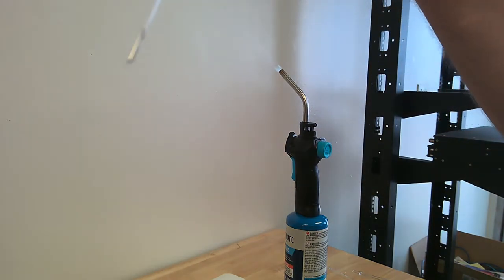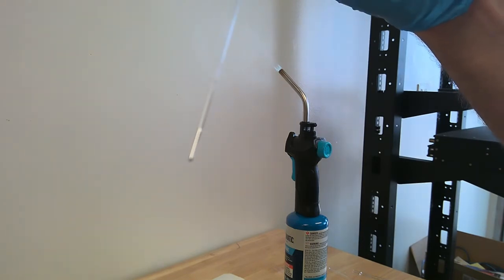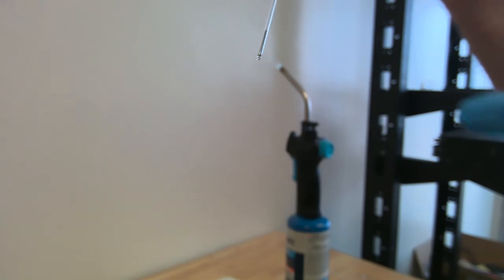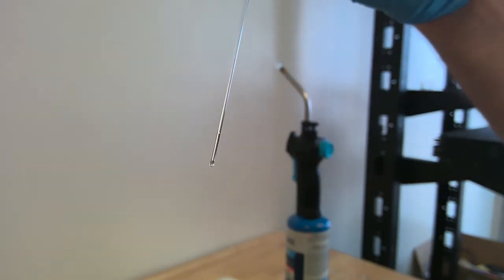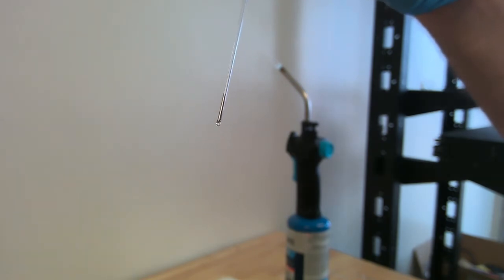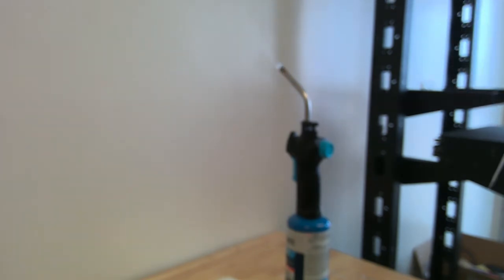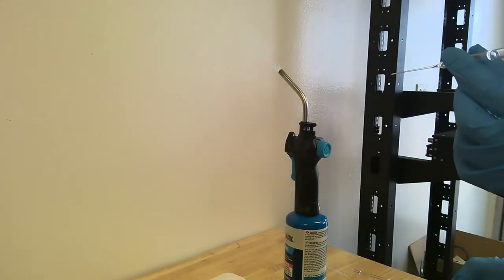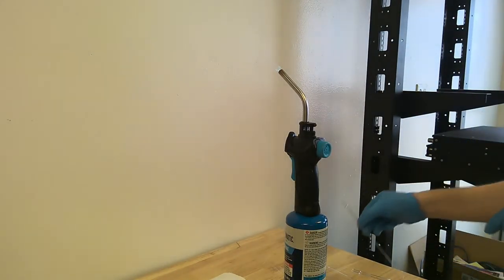So now we have our stir bar magnetic component at the tip of our pipette, and now we're going to seal off the end very carefully, and from there we'll have a nice complete stir bar. So we'll allow this a few moments to cool, and we'll continue on with our picnometer step.